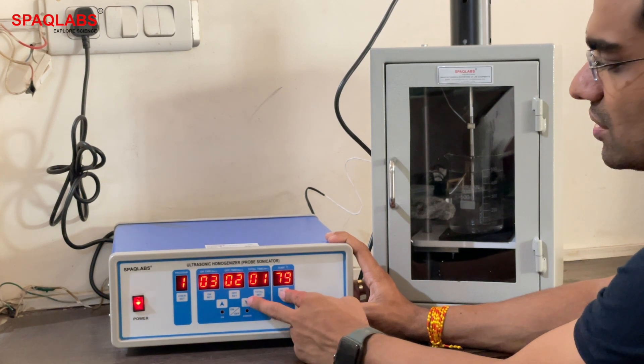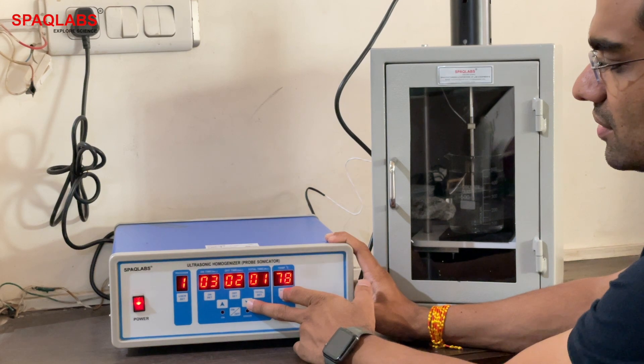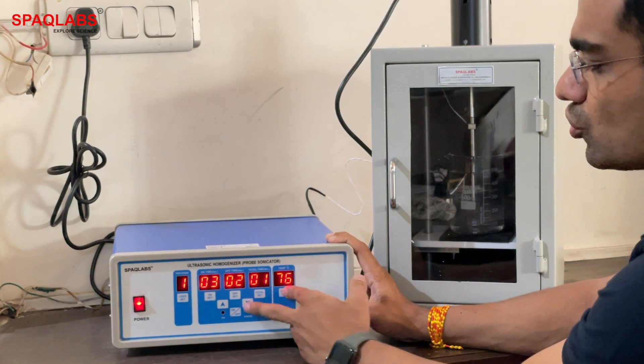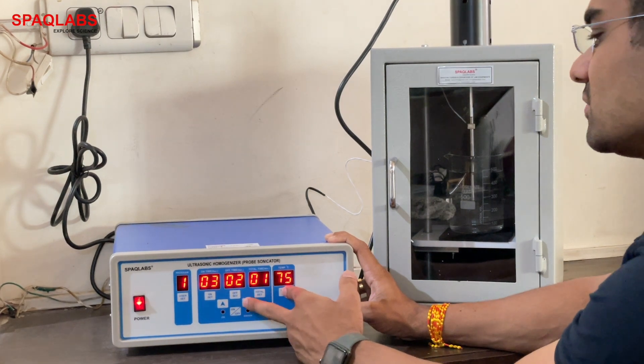For set temperature, press down to reduce the value, then press set to confirm the settings.